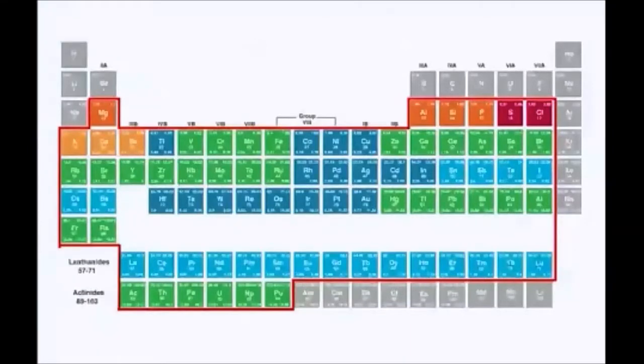We measure these elements, we normalize to 100%. That allows us to correct for size and shape, and that's the method that's used.